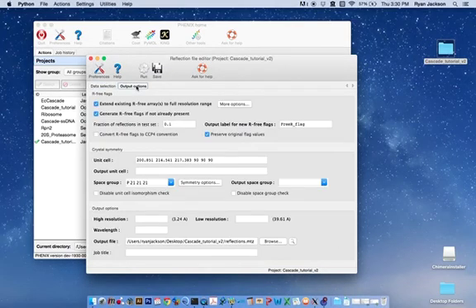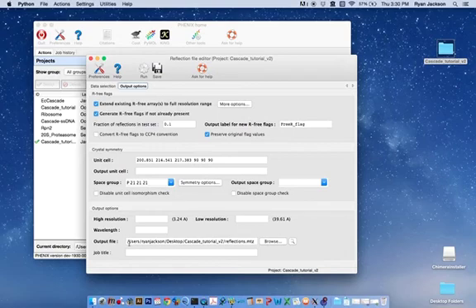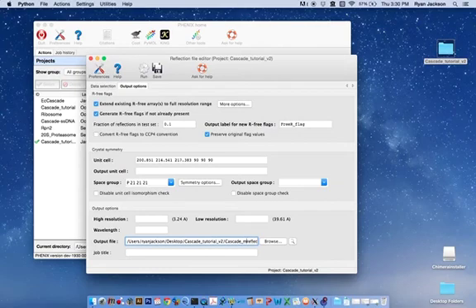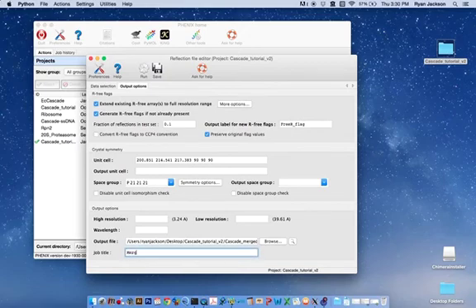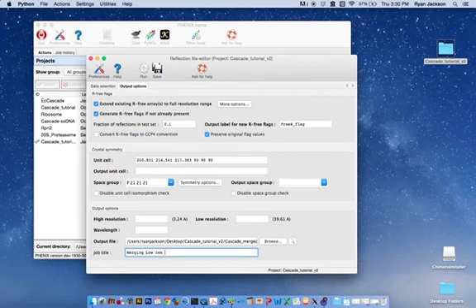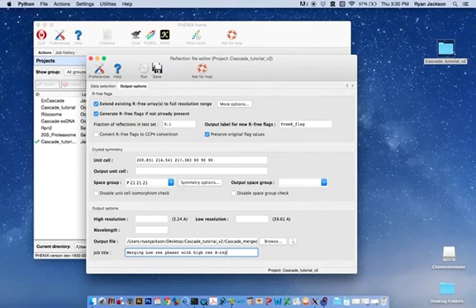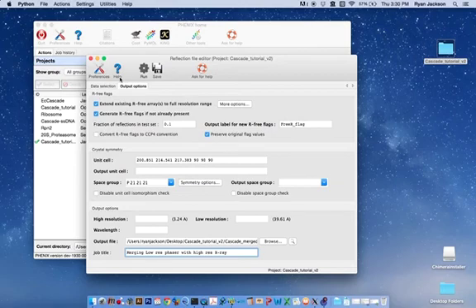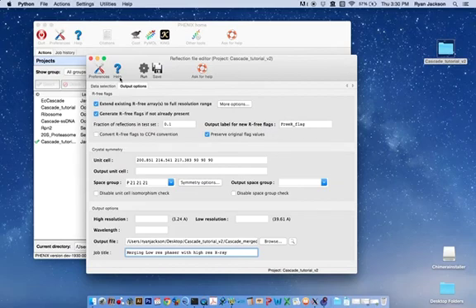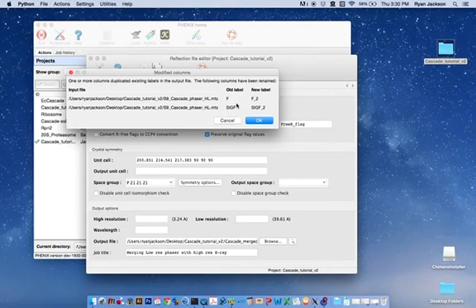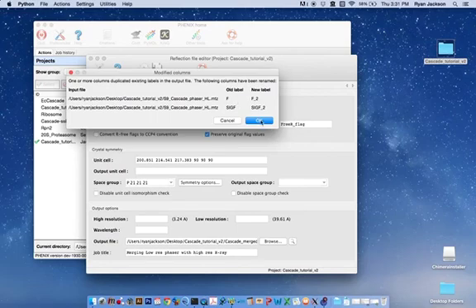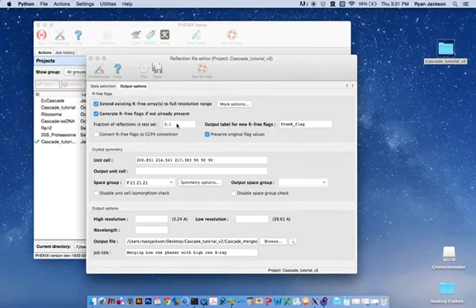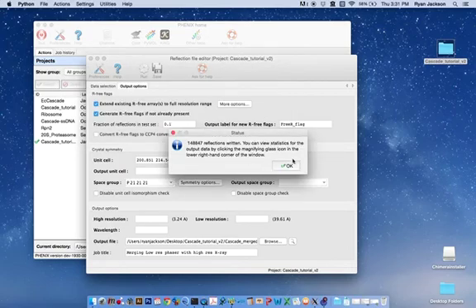Final thing is to go to Output Options and make sure that the output file and directory makes sense. I'm going to call this cascade merged reflections and job title merging low-res phaser with high-res x-ray. I'm going to run the program here. Here, it's telling us that it's had to change some of the labels because we have two structure factor arrays. This is okay for me. And, it's finished.